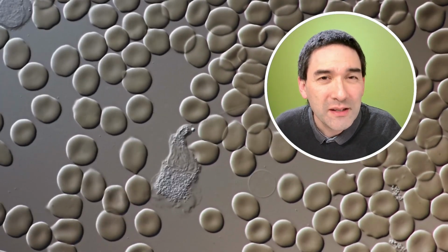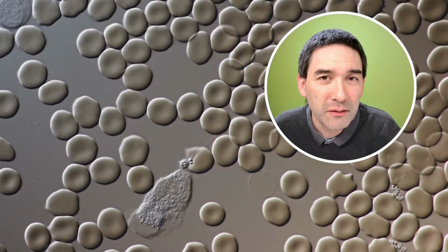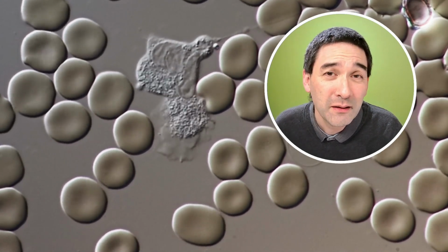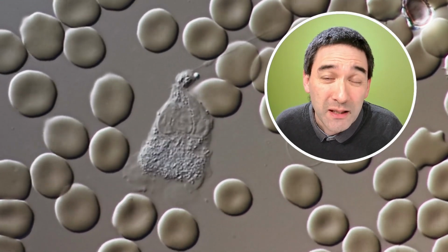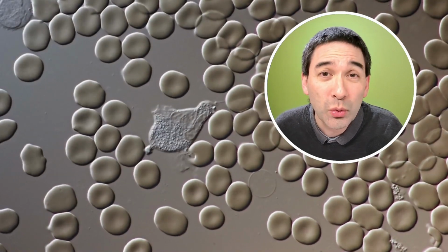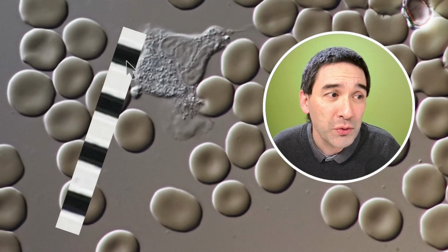So this here is now a little bit in time lapse, and you are able to see that it's moving significantly faster. It's 10 times faster than the original speed. And the problem now is, how fast is the original speed? For that you need a scale bar. So what I've done is I've taken a picture of a scale bar, a so-called micrometer slide, and I've superimposed that.